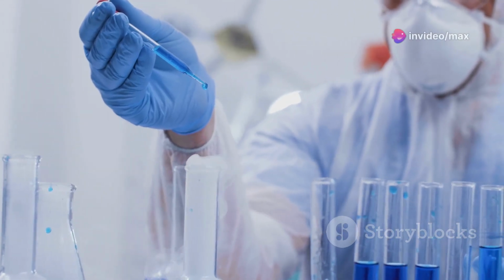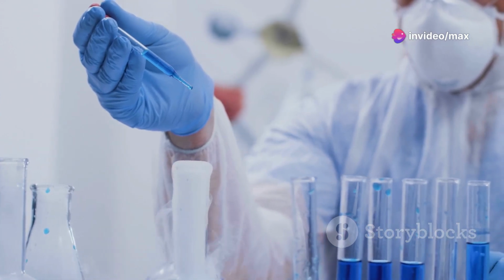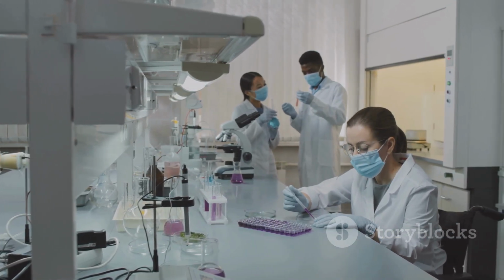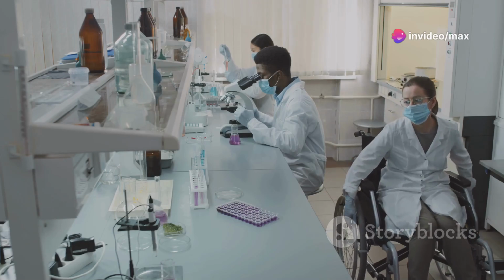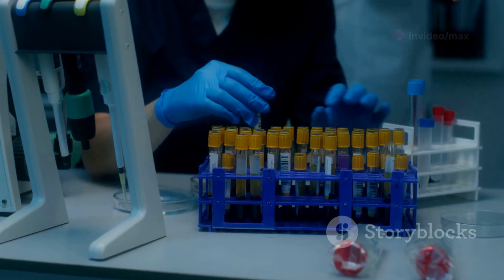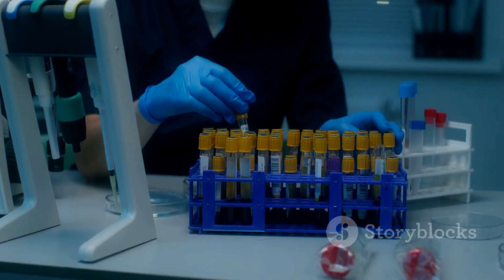Section 9. ELISA, a cornerstone of diagnostics and research. ELISA, in its various forms, has revolutionized diagnostics and research. Its applications are vast and diverse. First, ELISA is widely used to diagnose infectious diseases like HIV, hepatitis, and Lyme disease.